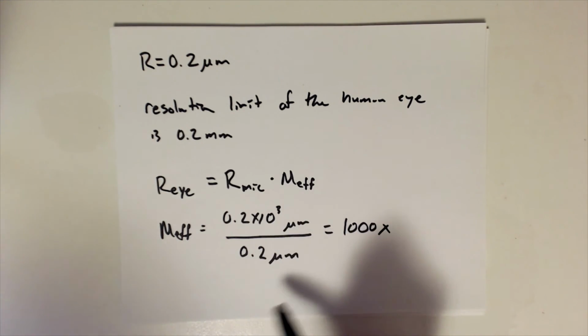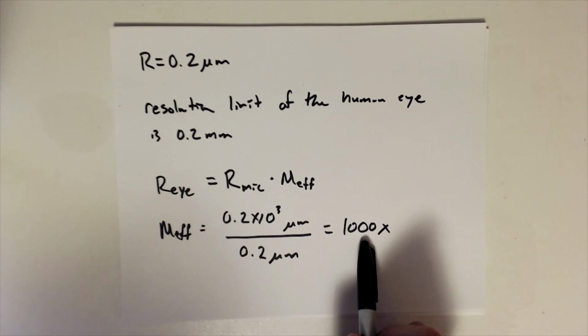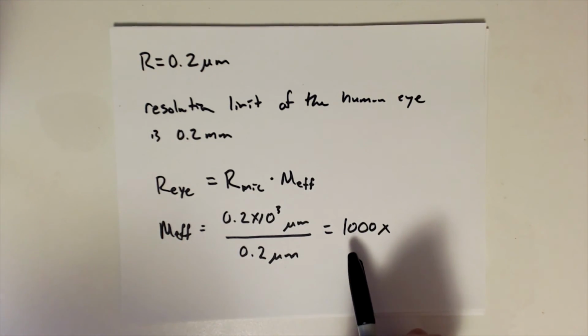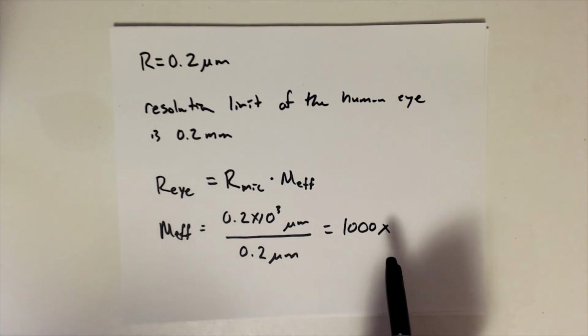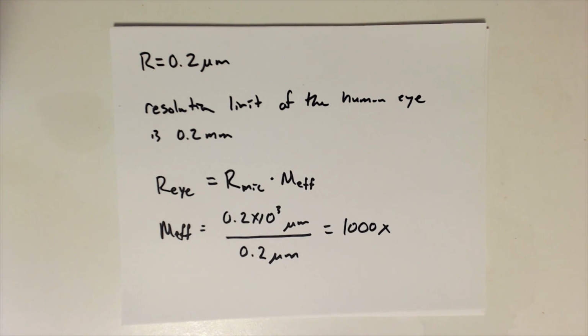And if you look at a lot of microscopes, you'll see that the highest objective lens is typically on the order of 100, but there is a 10x eyepiece usually. And so those two multiplied together, like we learned earlier, gives you 1,000x. So that's why you won't typically see anything over 100x objective lens.